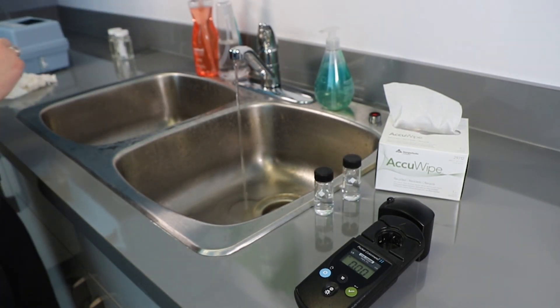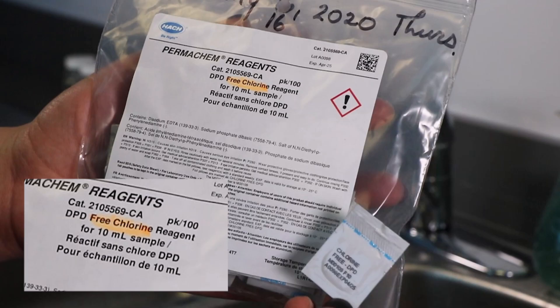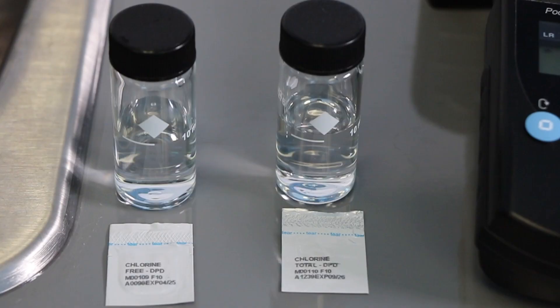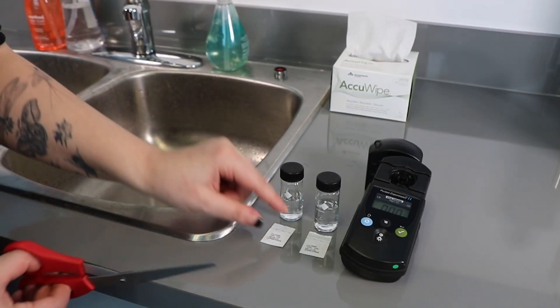For a low range sample of free chlorine, take one packet of DPD free chlorine reagent. For a low range sample of total chlorine, take one packet of DPD total chlorine reagent. Add the contents of the reagent packet to the water sample.